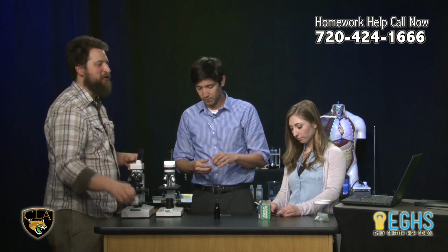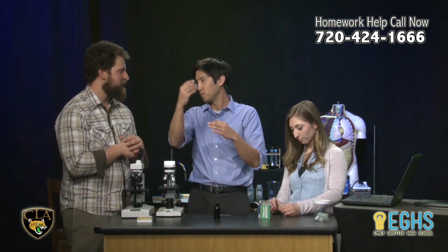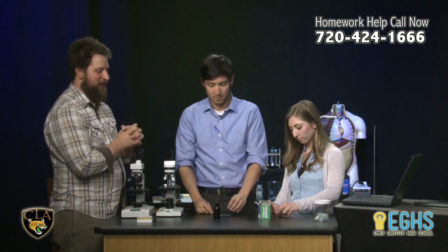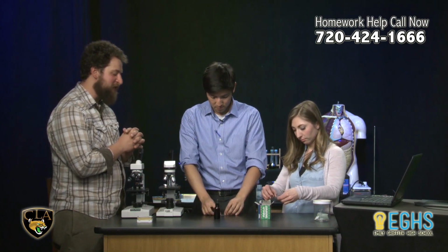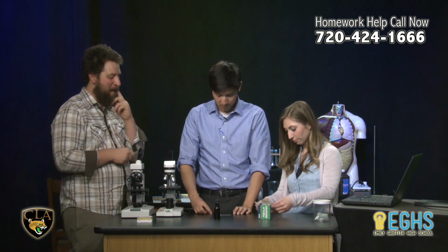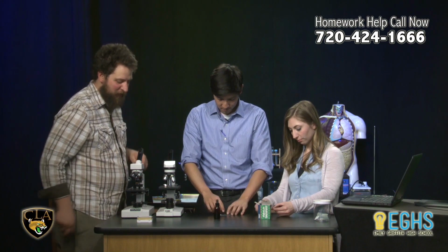Right. And you can see in 3 dimensions, but only a 2-dimensional plane is really in focus when we take a picture, right? And you're in focus and everything else is a little bit blurry. Exactly. Okay, so just cover your blue dot, and you should see it spread out a little bit as you do that. You can push it down just to get it to spread a little bit more. Okay, cool.